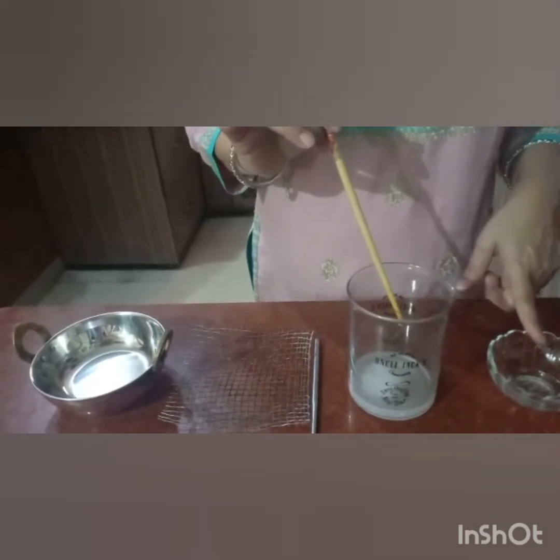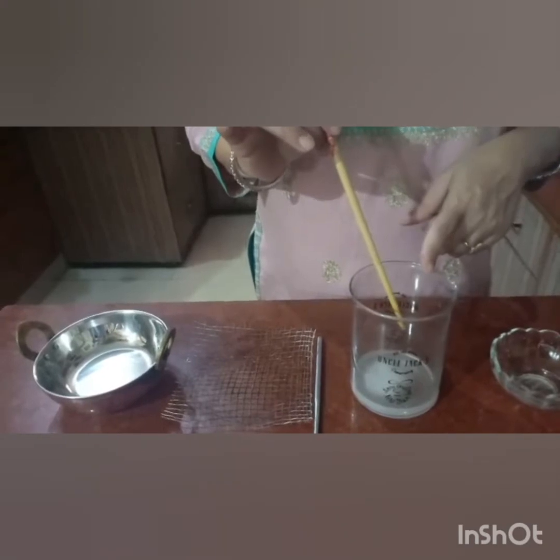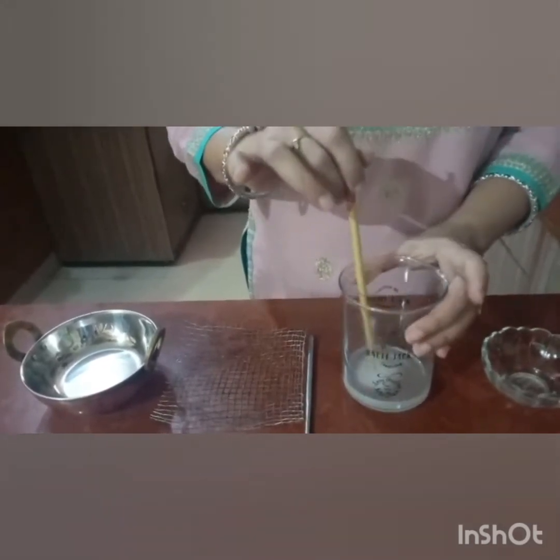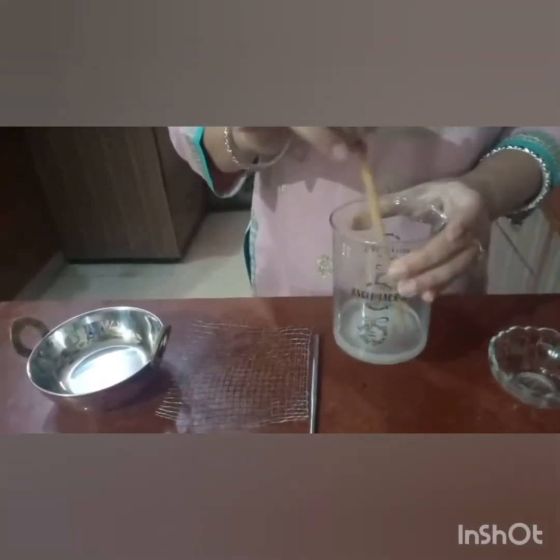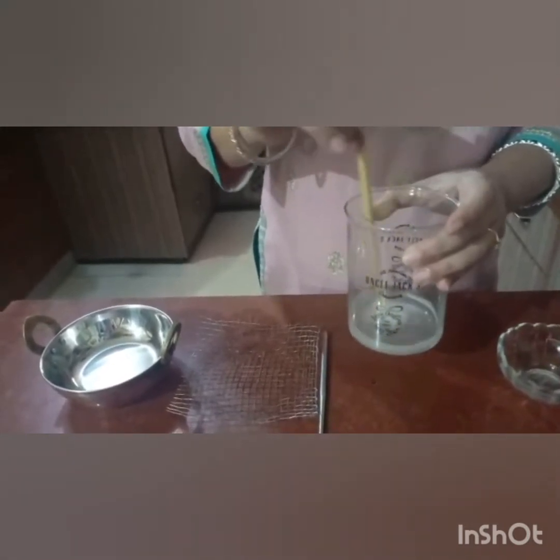When the solute completely dissolves in the solvent, we call it a solution. And in a solution, the solute particles are not visible. They should completely dissolve in the solvent.